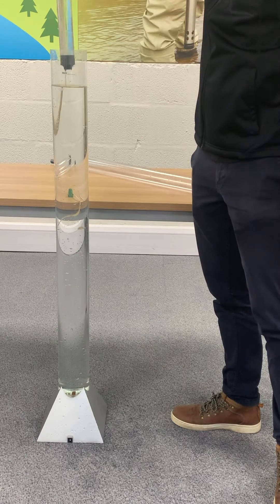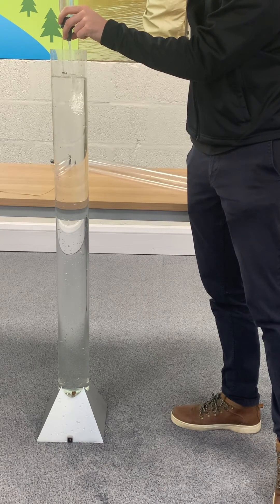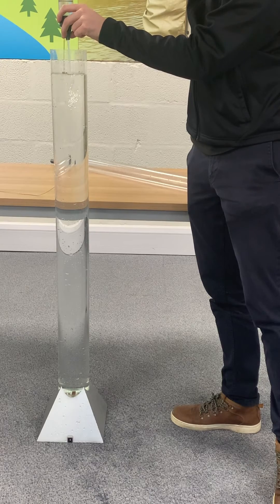Although there are better methods, many people purge their wells using balers. It's actually a pretty disruptive way of doing things, and an inertial pump is usually quicker.